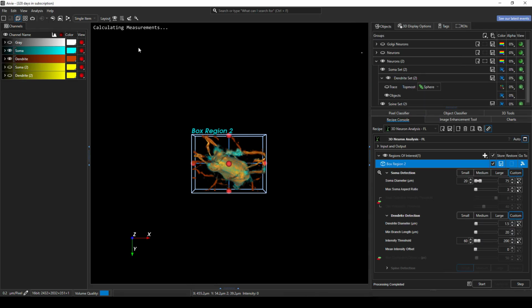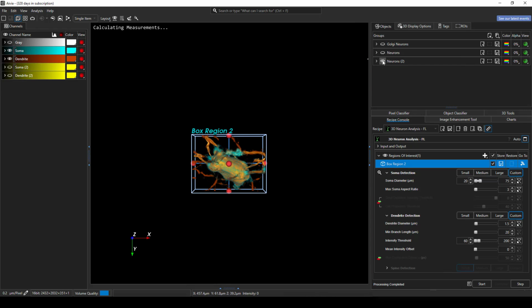All right, so our analysis is done. It did a decent job, but of course you can continue to further fine tune this if you would like. I'm going to go ahead though and do my thing of providing you with previous results that I've done, and this time for the full image.